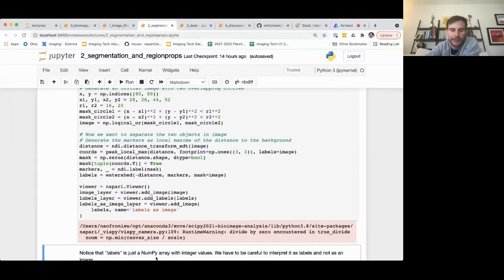And if I come back to Napari, I can look at this, and all right, this is the image that we're looking at. It's these two circles. In Napari some of these functions will actually be easier to introduce when we look at a real image instead of this kind of simple toy one. So maybe I'll hold on a second before giving you a tour of the Napari interface. But you can see already that we've got a canvas here and a camera, and we can move around as well. So, okay, if we want to separate these images, how can we start thinking about doing that?